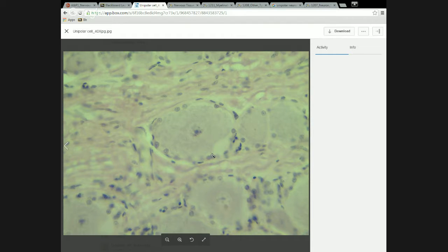Now, there's a picture in the book that shows a more three-dimensional representation of these cells together, and the satellite cells kind of make an outer coating around the whole cell. So they kind of protect the cell from what's around it. They do not make a blood-brain barrier because we're not in the brain here or in the central nervous system. But they do have similar kind of protective, supportive functions as astrocytes that I talked about earlier.